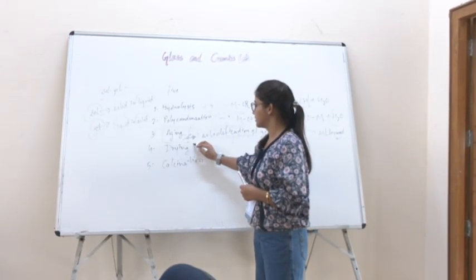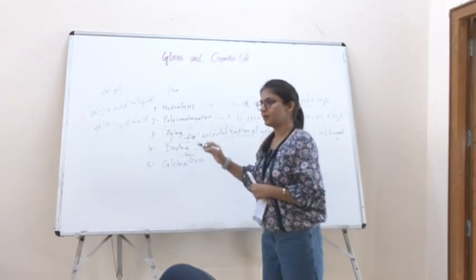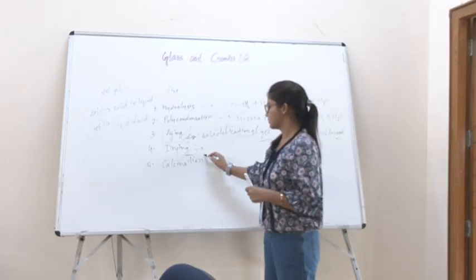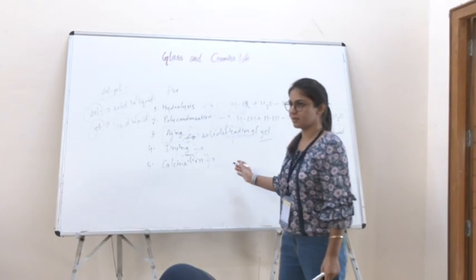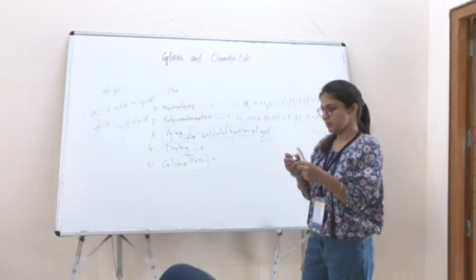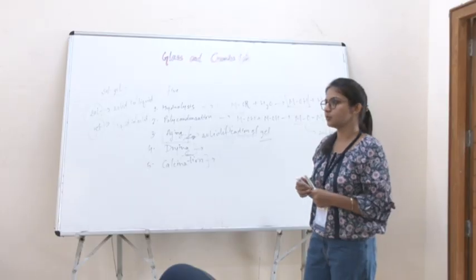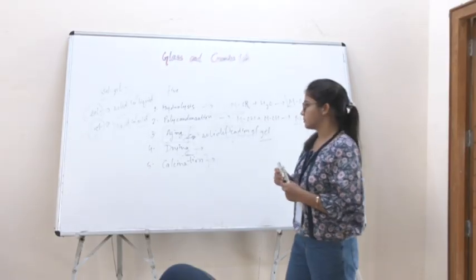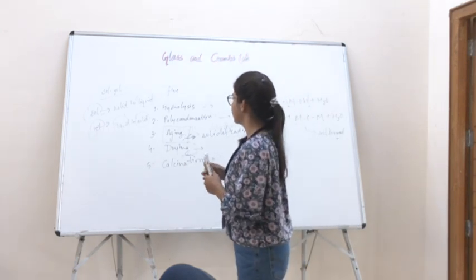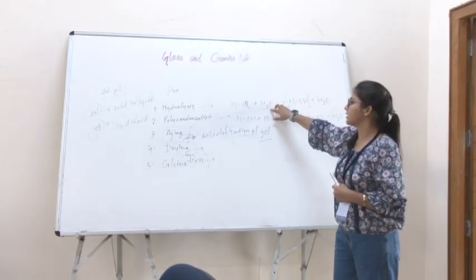After that we'll dry it in a hot air oven. And then further we put it for the calcination in a muffle furnace. As sir mentioned, at first we have to do the TG-DTA of the dried sample, to know the crystallization temperature of the material. Basically, as I mentioned, in the hydrolysis we can take water.